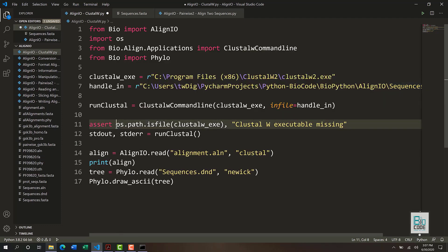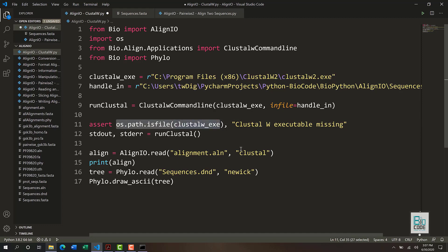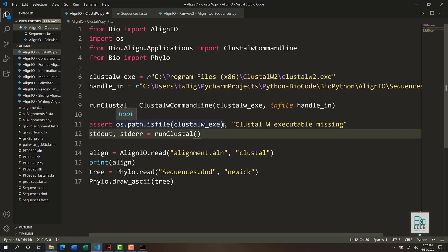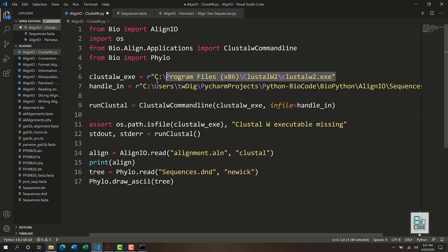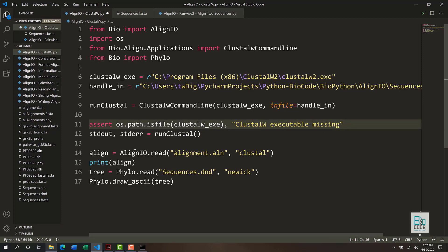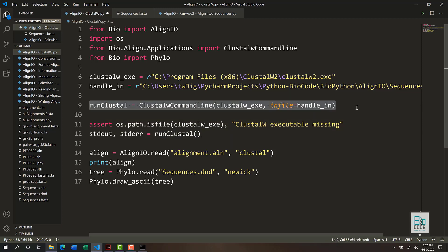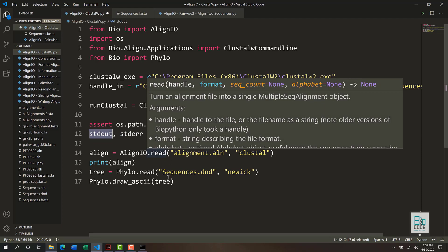After that, we assert that clustalw.exe actually exists on the computer; otherwise it will not be executed. If ClustalW is not installed or you have provided a wrong path, it will print the error that the ClustalW executable file is missing. Otherwise it will run the ClustalW function we created, start the alignment, and print any errors or positive output that result.